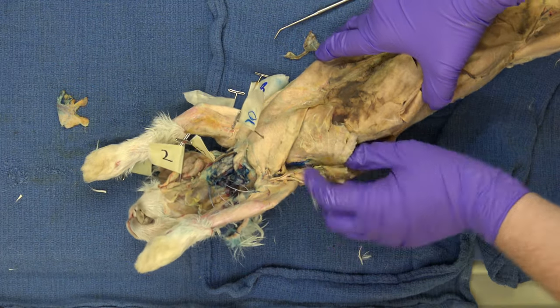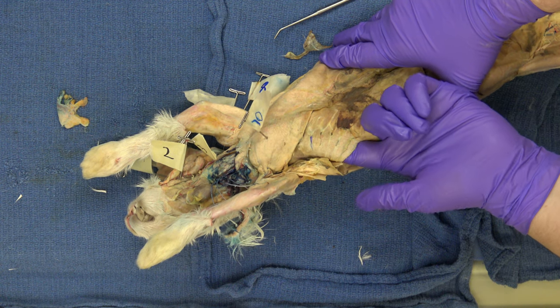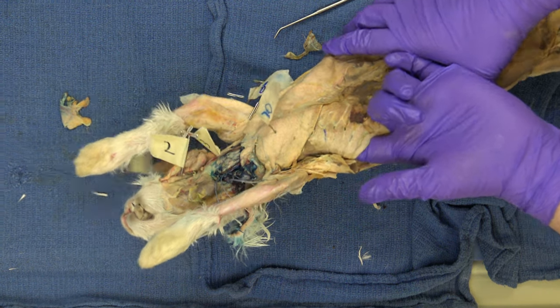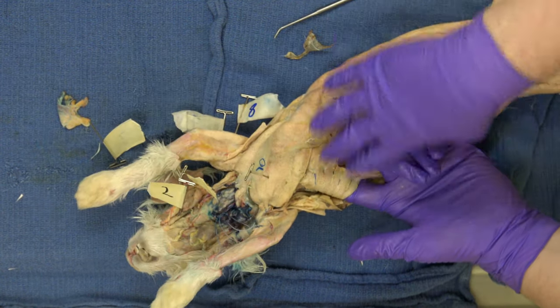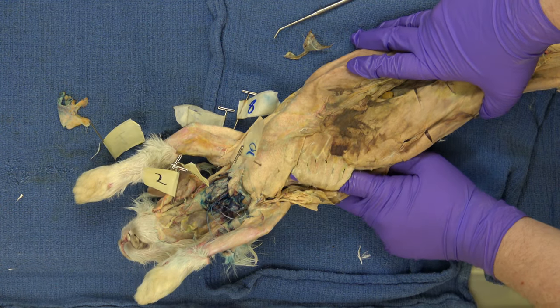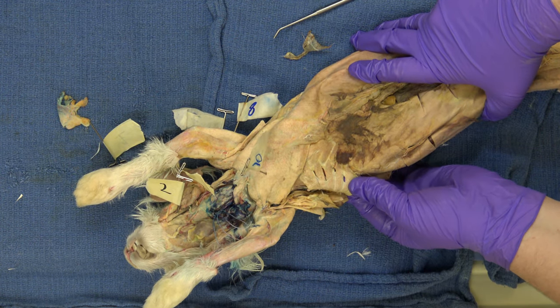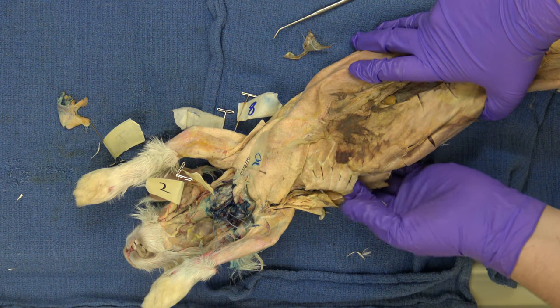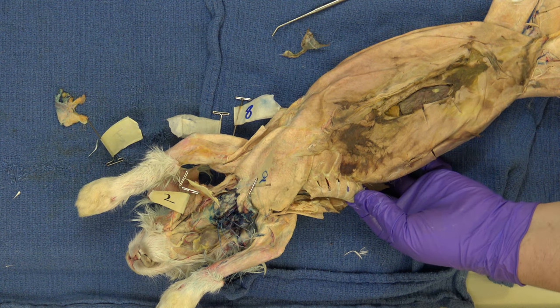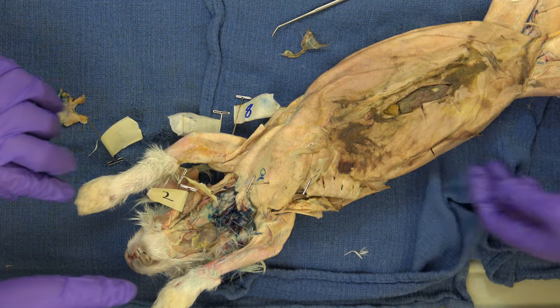If we go a little caudal to the pectoralis, we have a muscle called the serratus ventralis, also called the serratus anterior in humans. That's because if we're bipeds it goes anterior, but we're quadrupeds, so it's going ventral. I'm using serratus ventralis because that was the first name. It's serrated here. This is a throwing muscle — if you played baseball, this is the pitcher's muscle. That is number 11 on your list.